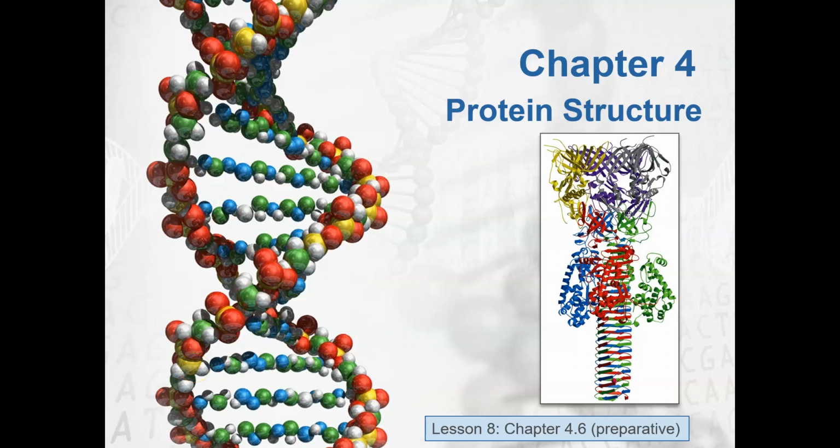Hello everyone. The subject of this video is covered in section 6 of chapter 4 of Essential Biochemistry, and here we review preparative techniques for separation of proteins.